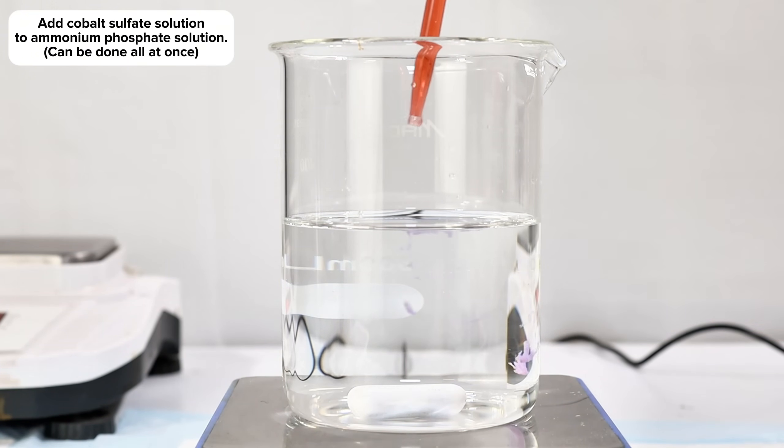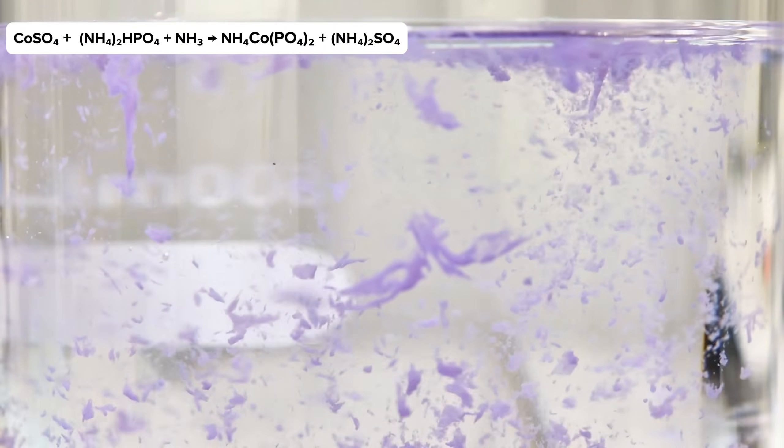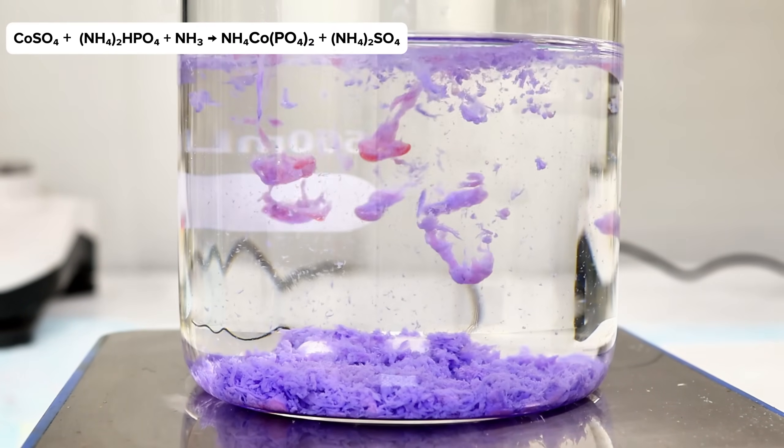Anyway, once my two mixtures were complete, the next step was to simply add the cobalt sulfate mixture directly to the alkaline ammonium phosphate. This can be done all at once, but I decided to make the addition slowly to better capture the beautiful double replacement reaction.